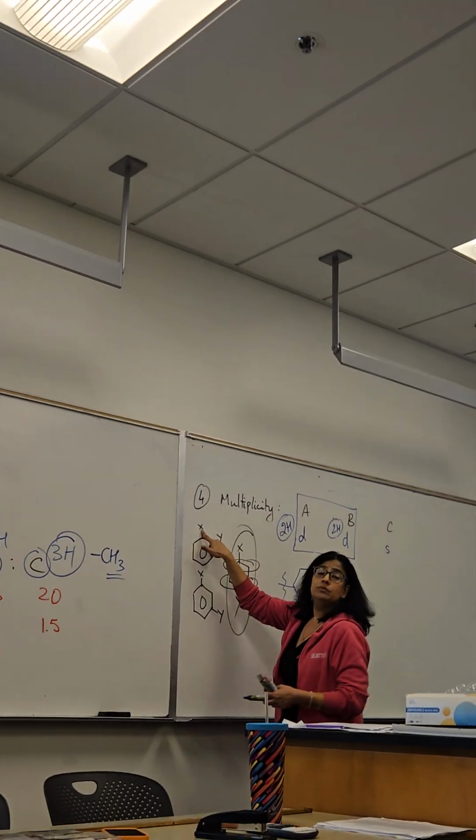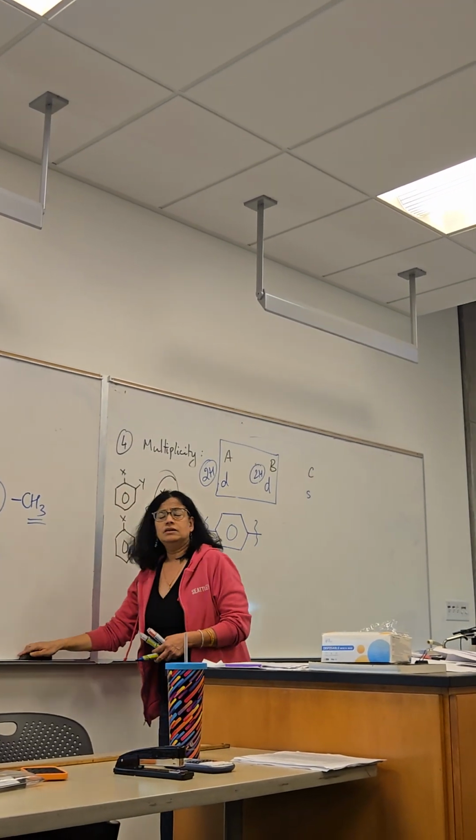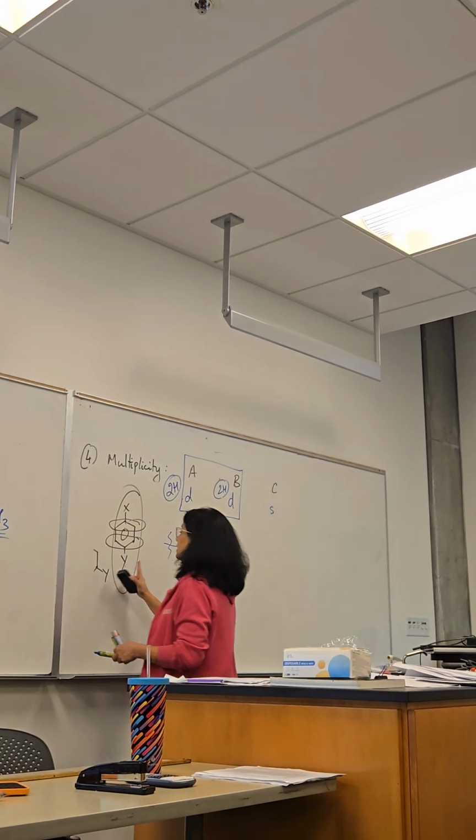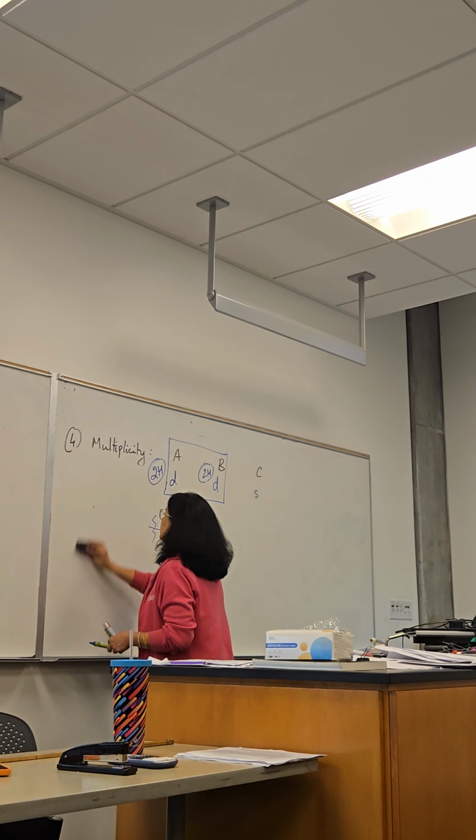1,2 will, again, if X and Y are different, which we are assuming they are in this case, give you a complex pattern. Exactly. But this is the cleanest one. This is the one that's easiest to see. Are we all good? Yes.